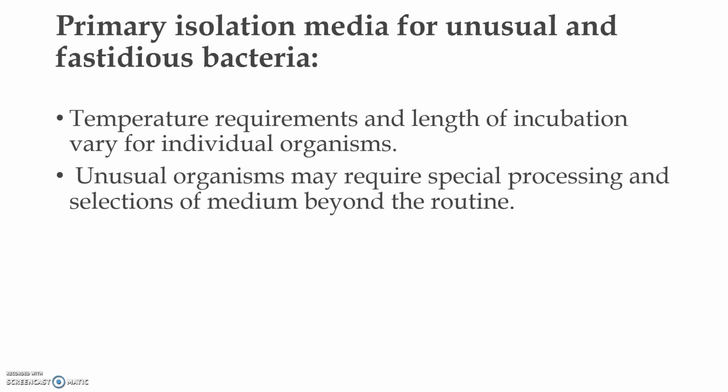We have already mentioned that the primary isolation media for unusual and fastidious organisms require special necessities. For example, temperature requirement and length of incubation may vary with the individual organism.